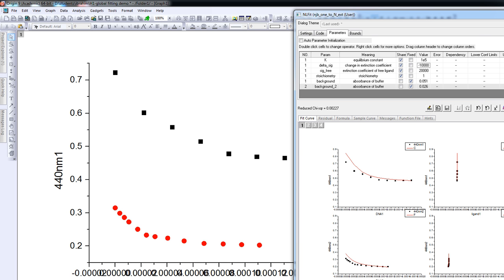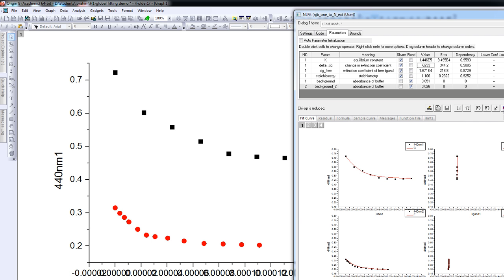This means we can start the fitting. You can press 'fit until converged' in one go, but especially with a new dataset, it is good to first do just one iteration to make sure it doesn't go completely out of control. Clearly it did not, so we're confident the iteration will converge correctly. We press 'fit until converged,' and here we get the outcome: the equilibrium constant is around about 2 times 10 to the power 5, along with the error on the equilibrium constant, the change in extinction coefficient, the original extinction coefficient, and stoichiometry — all with error margins. The fit has converged.